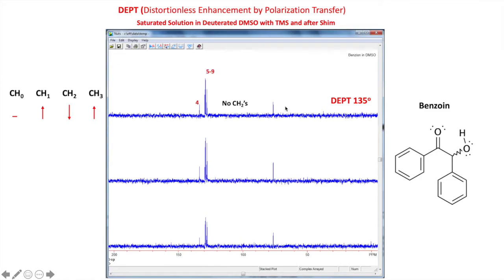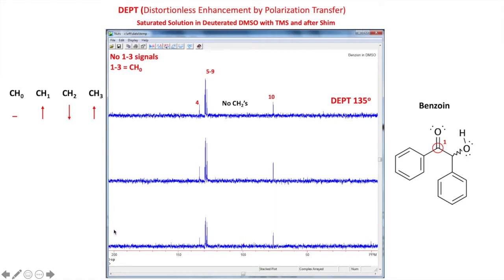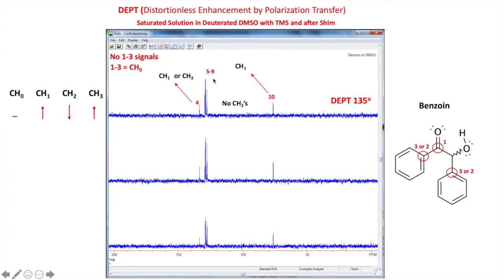Now let's number our carbons: one, four, five through nine, ten. We're missing carbon signals one through three. That means they must be carbons with zero hydrogens because they're not shown. The carbonyl carbon at about 200 is not showing, confirming it's a CH0. The other two carbons we thought were signals two and three also didn't show up, so the two spectra agree. Carbon four pointing up could be CH or CH3; carbon 10 pointing up is also either CH or CH3 — we need more information.